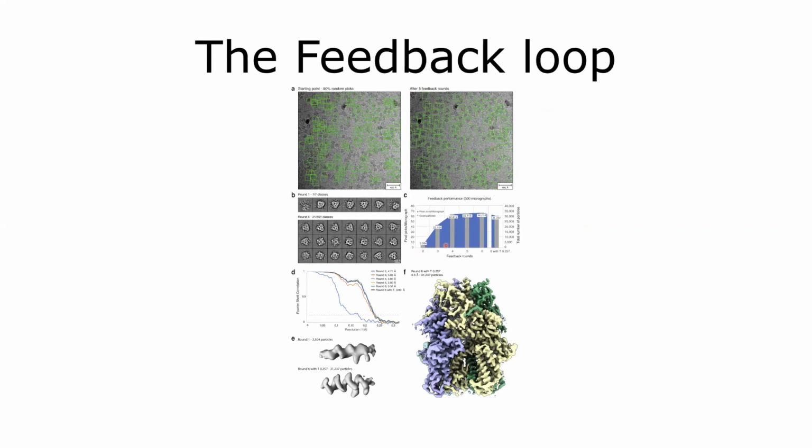As you can see from this graph, this already happened after about the 5th feedback round, and it gave the best results. The crYOLO toolkit also provides a tool to evaluate the best picking threshold for your model.